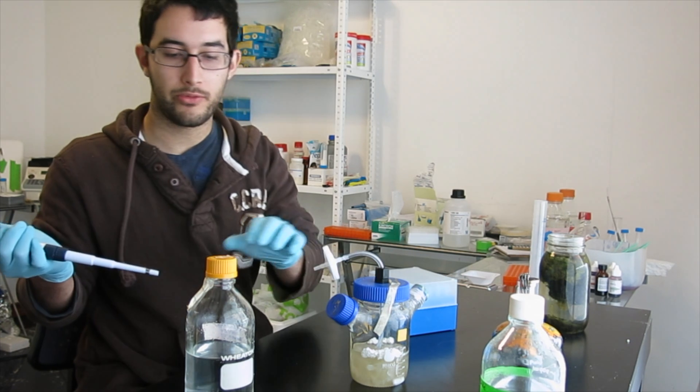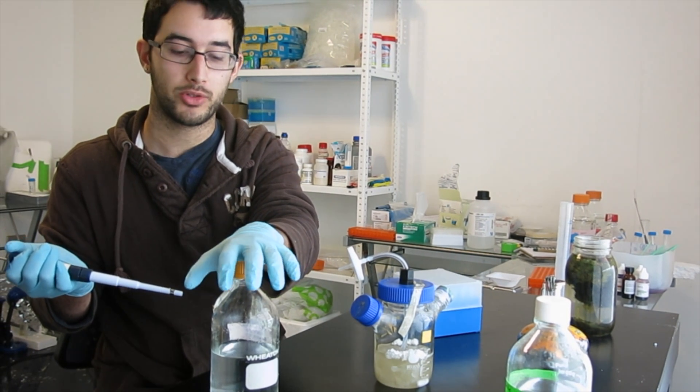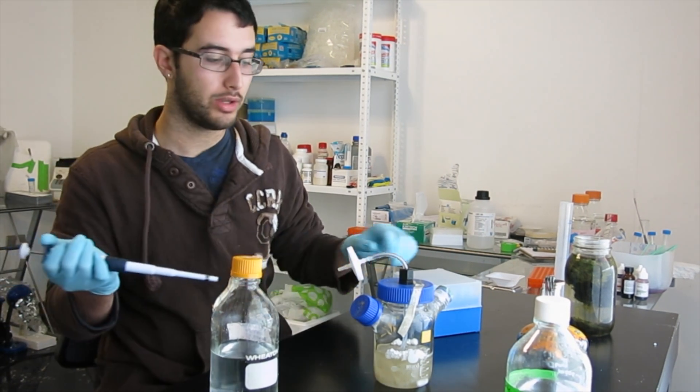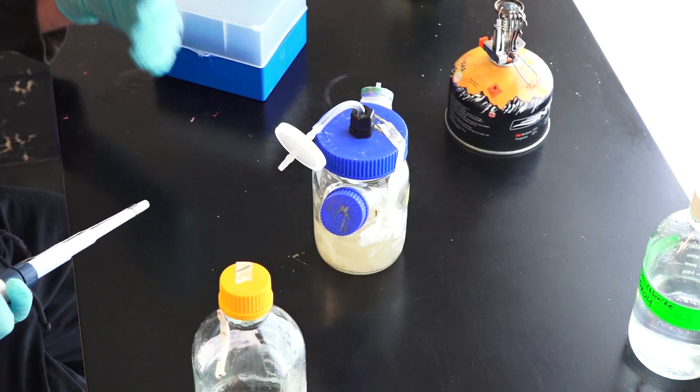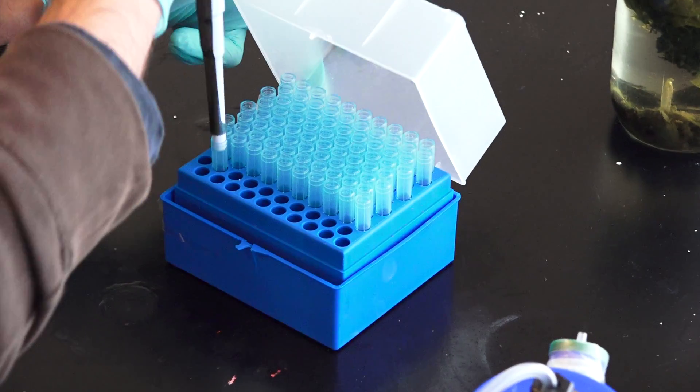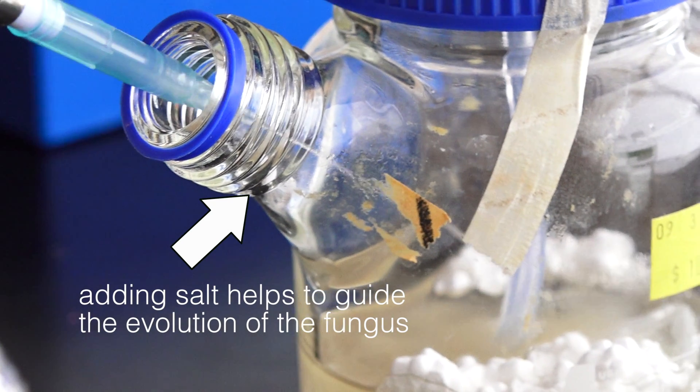Right now I have a bottle of sterile seawater which we collected from the ocean and sterilized in our little autoclave. And so every morning I add two milliliters of this to my bioreactor so that I can slowly increase the salt concentration and eventually make the fungi able to survive in the ocean.